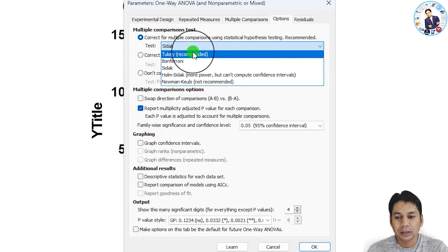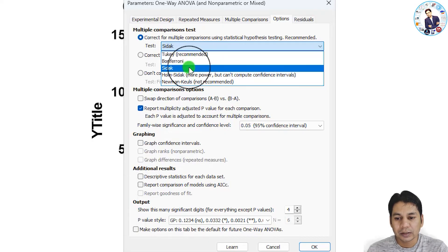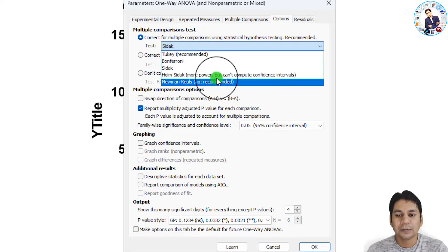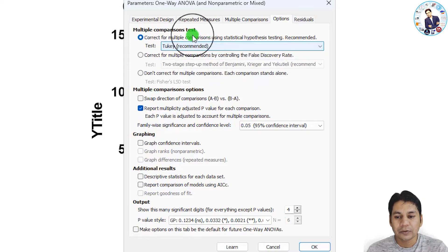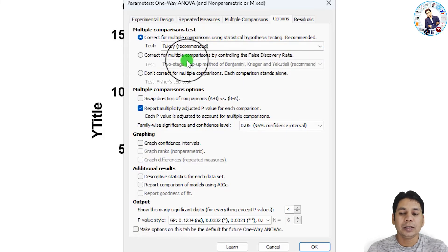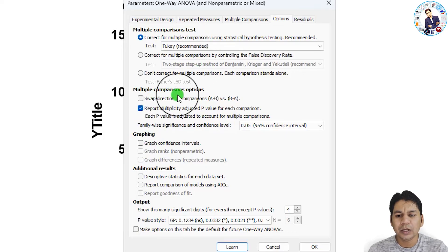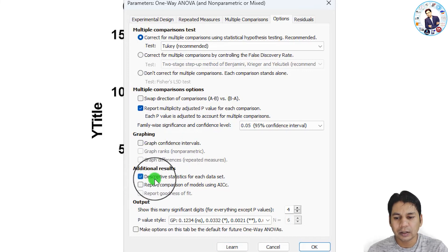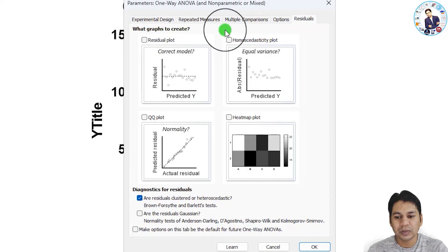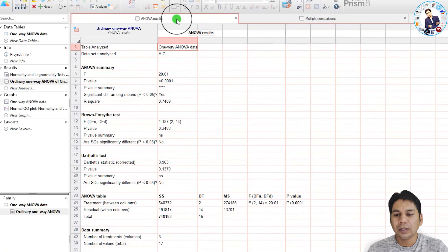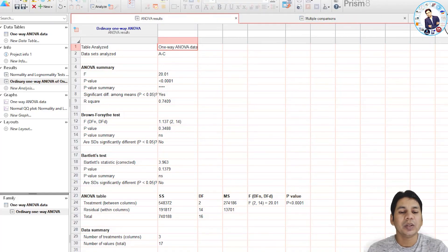For the multiple comparison test, the available options include Tukey, Bonferroni, Sidak, Holm-Sidak, and Newman-Keuls tests. GraphPad Prism recommends the Tukey test, so I am selecting it. I am leaving the remaining options at their default values. Under 'Additional Results', I am enabling 'Descriptive Statistics for Each Dataset' and leaving residuals unchecked. Then click 'OK'.